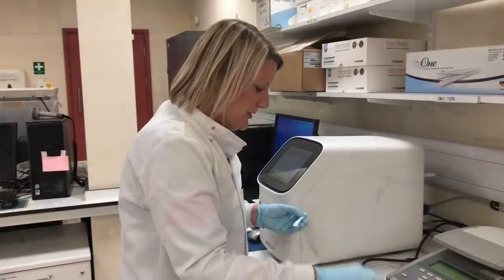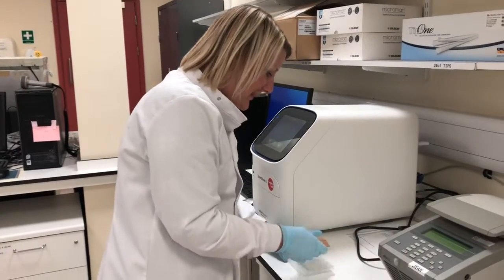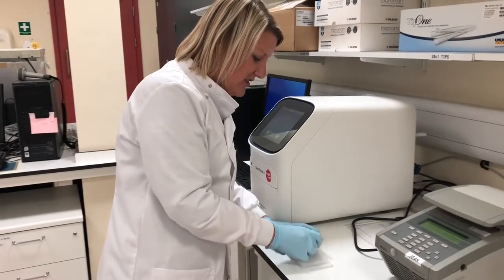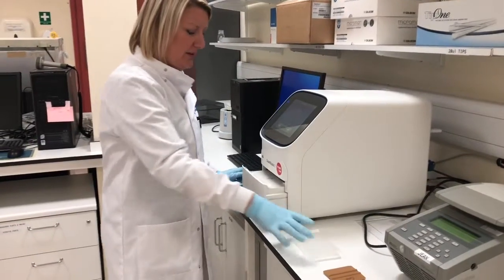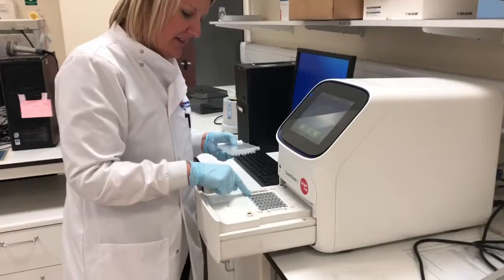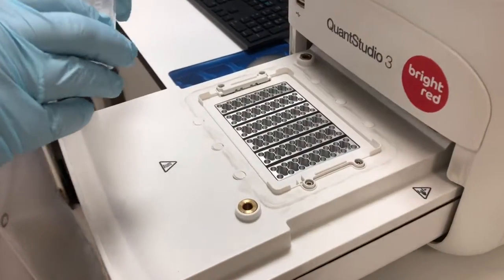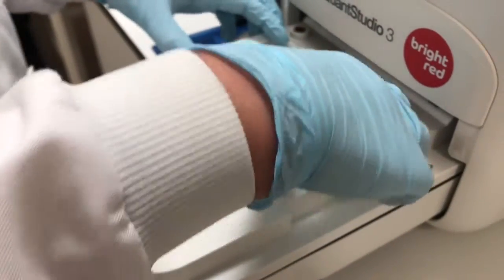Before we can put the plate in the machine, we just need to seal it with a lid, and this is an optical lid, which means that the machine can read through the lid and see the colour change reaction in the wells. So to load the machine, we just press the eject button, and if you see, there's a little 96 well heated plate in here, which heats up very quickly and cycles between the different temperatures that we want to look at, and we sit the plate in there.